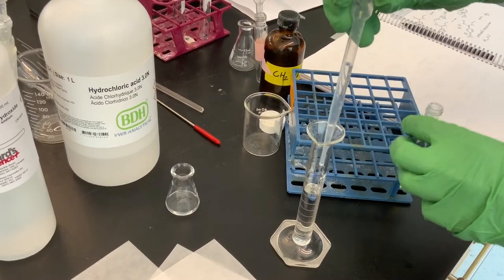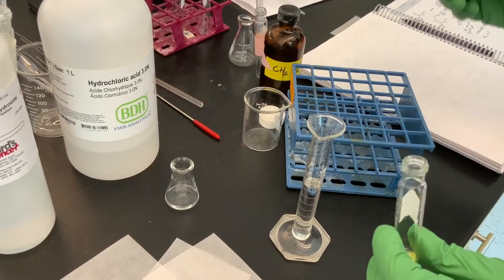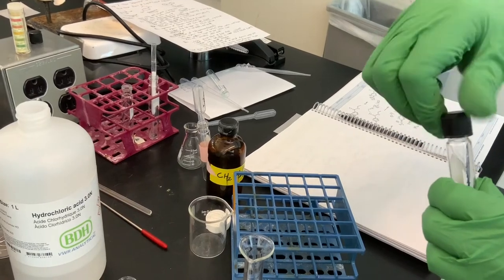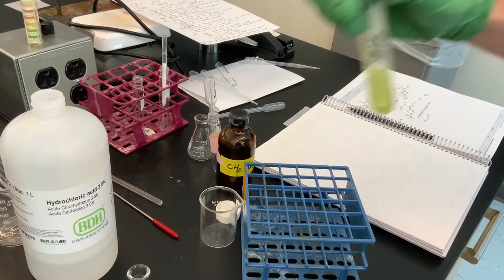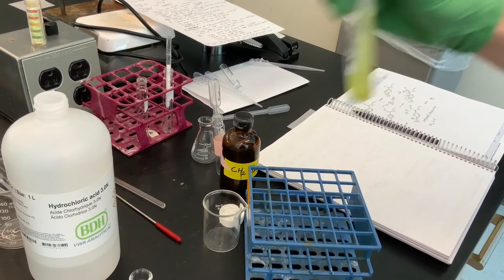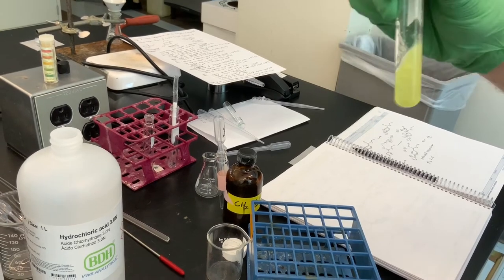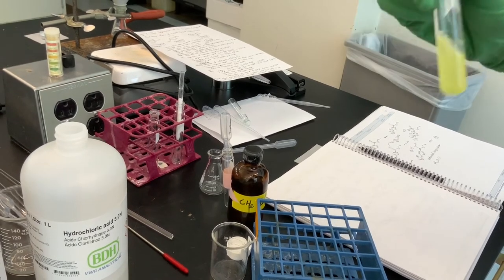And so this is a change to the procedure. We're going to repeat it because I can do it faster, hopefully, then we'll hopefully get a better isolated yield. So let me cap it just in case. So don't need that 3 molar HCl anymore. So I'm mixing the two layers. We're hoping that any extra benzocaine that we didn't catch in the first extraction is now going to go into our aqueous, our top aqueous acidic layer.